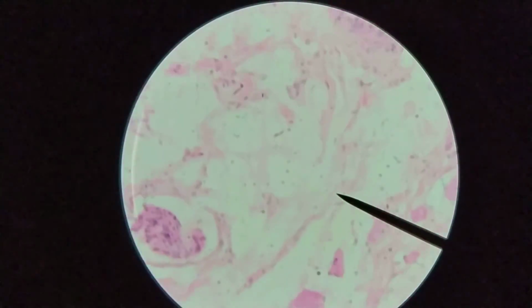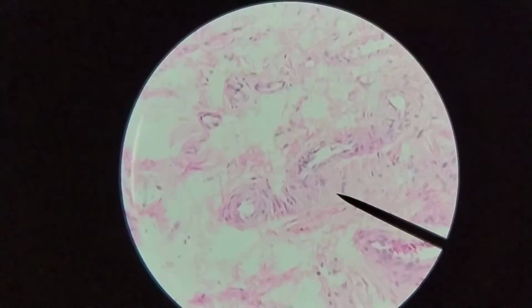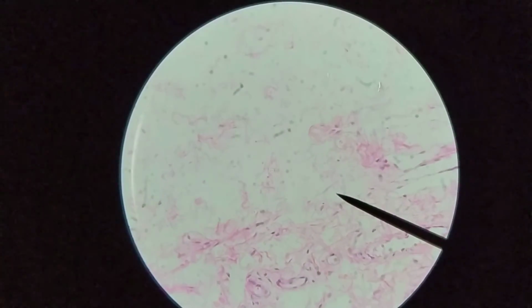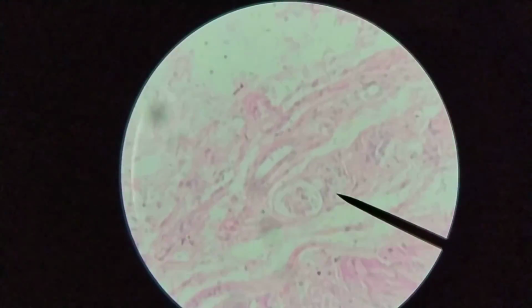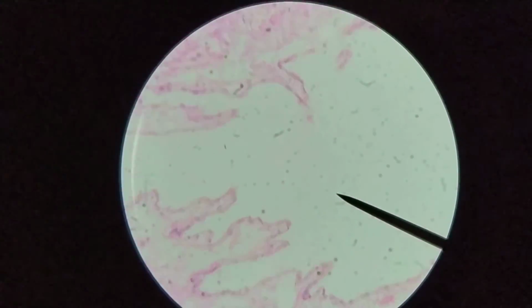As we go beyond the tunica muscularis, we get into the tunica adventitia, more connective tissue, some blood vessels, and so on. Again, there's no clear boundary here. But as we go a little bit deeper in, we start to see a change.